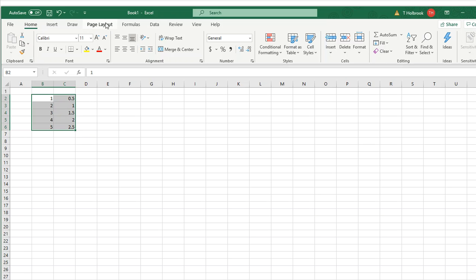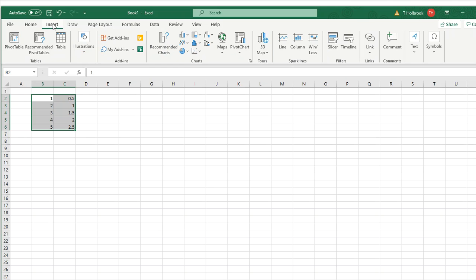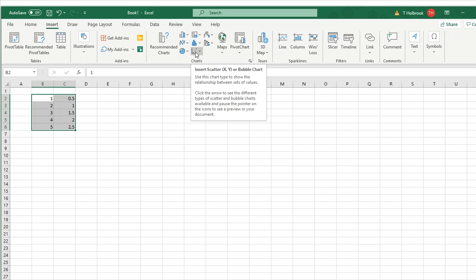And then up here at the very top, I'm going to see Insert. So I'll click it. And then in the center of the screen, I'm going to see a couple of different graph, chart options, and we use just the dots. We don't like it when Excel forces a line to go through everything because we know data is not perfect. It shouldn't go through everything. So in the beginning, the only thing that I want is it to plot the data points. No line at this point at all.